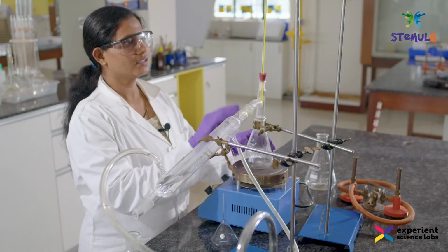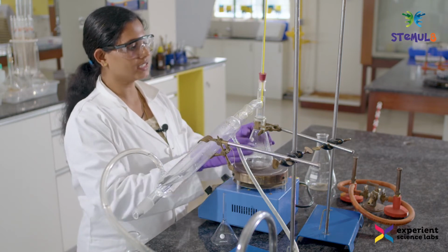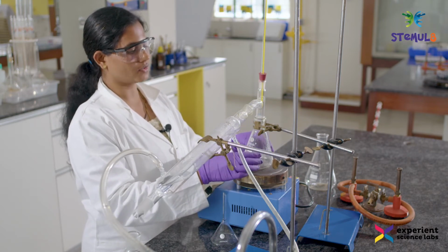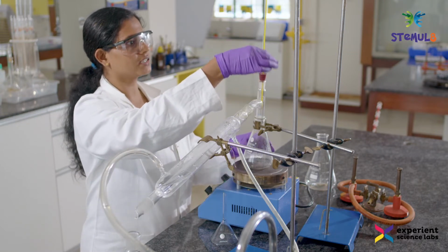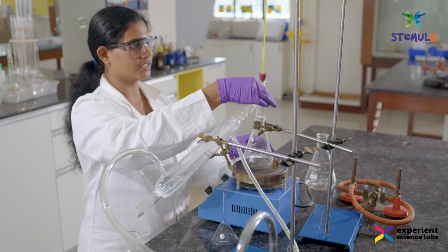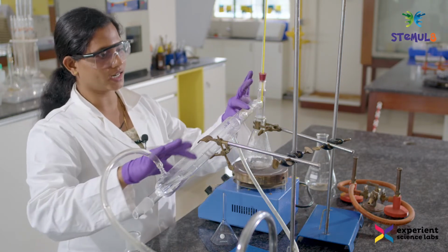To begin with, the demonstration consists of apparatus like a conical flask of around 250 ml, a distillation head, and a thermometer placed at the head of the distillate. And then this distillate is connected to a condenser.